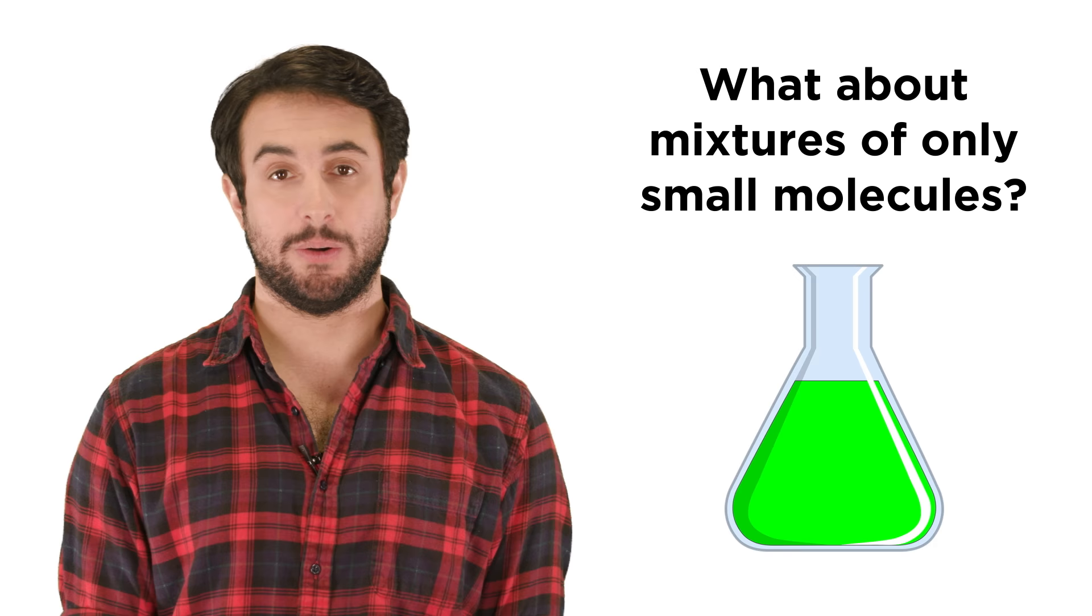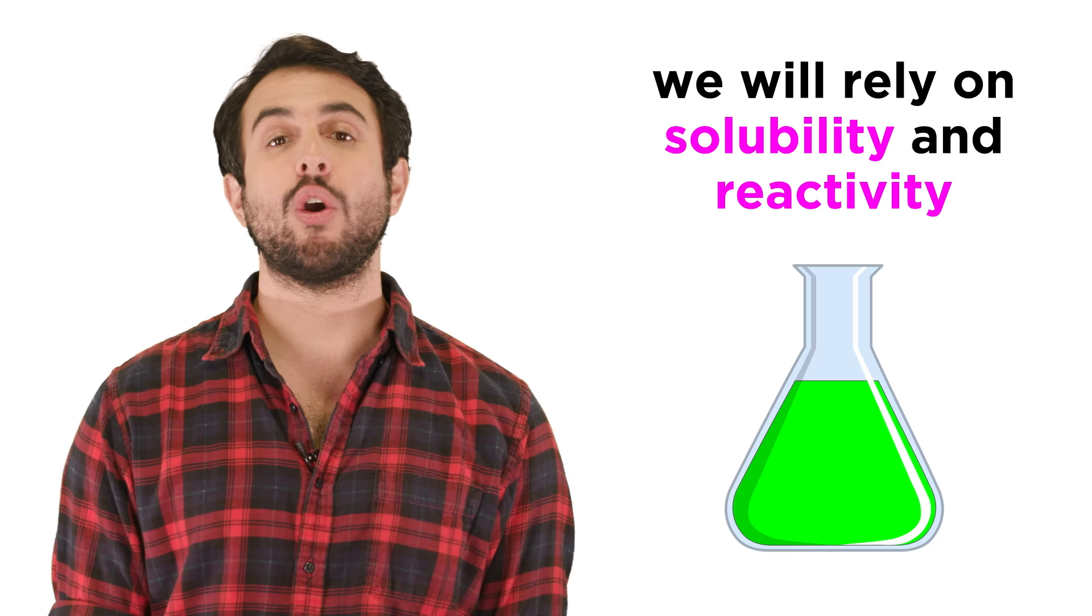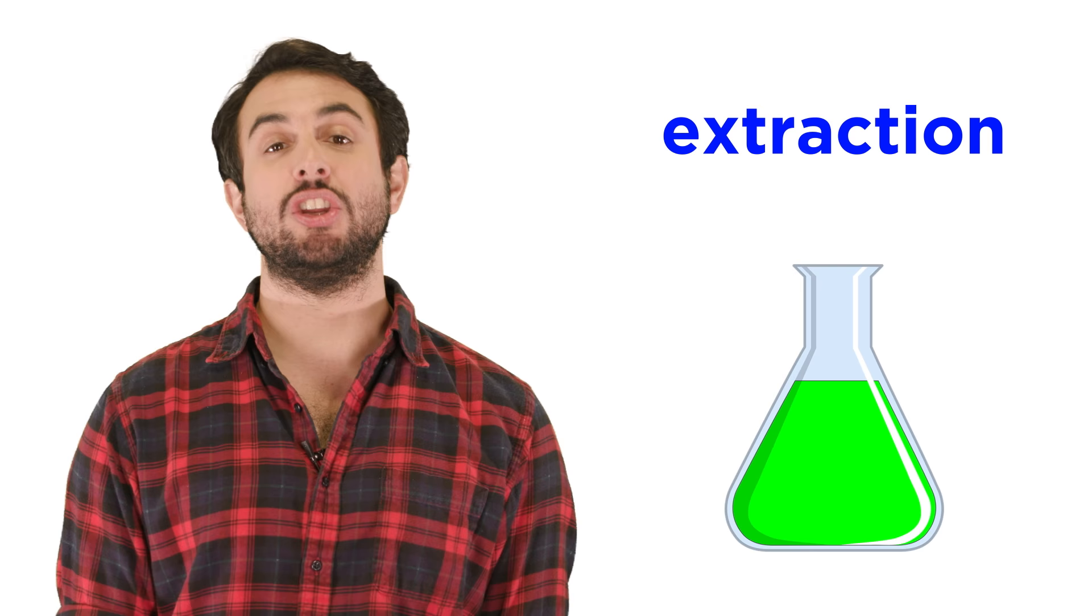Particle size will not be of any help here. Instead, we can make use of certain physical properties, like solubility, or even chemical properties, like some specific type of reactivity. A technique we can use to do this is called extraction, so let's learn how to do this now.